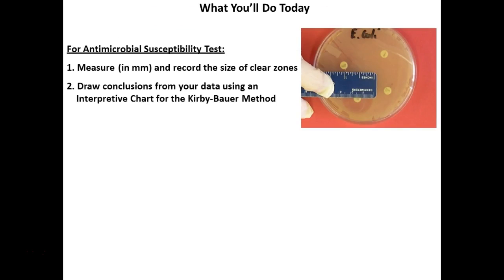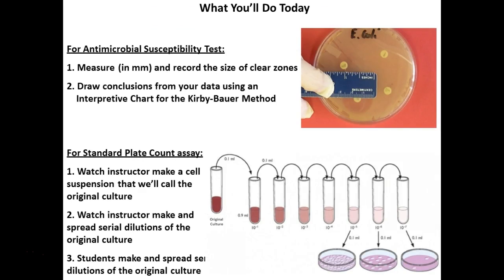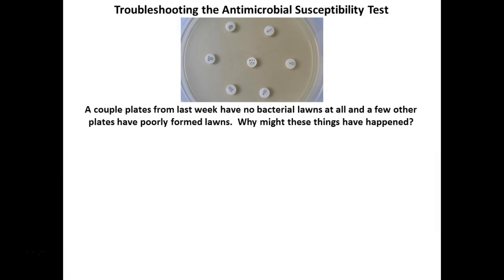All right, so you have already measured, and as I said, I'm going to show you and let you play around with pipetting today. We're not actually going to do the full-blown procedure with bacteria. I spoke about this earlier, especially when you prepared your plates. My other class had already prepared theirs. The importance of actually following the procedure is so that we have accurate results.